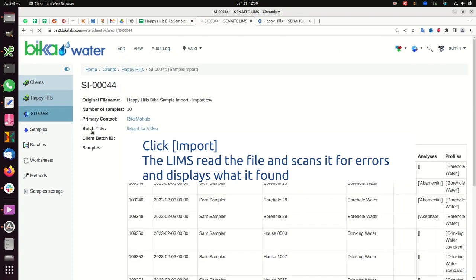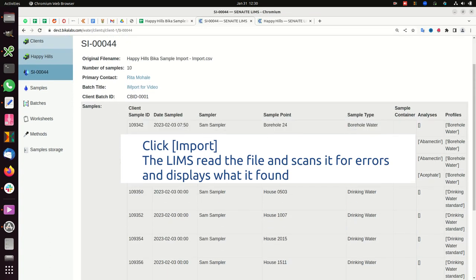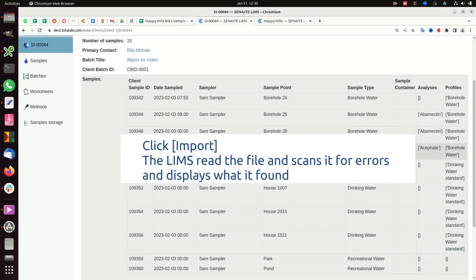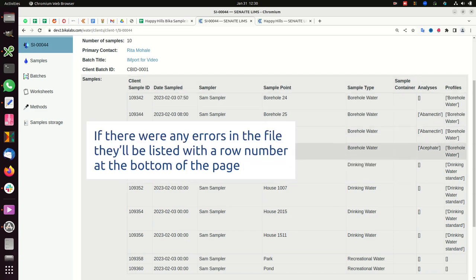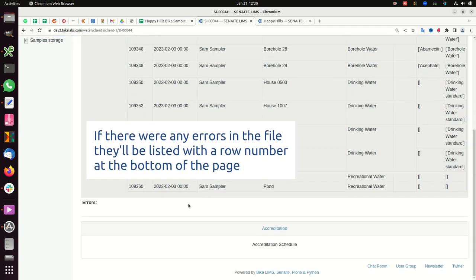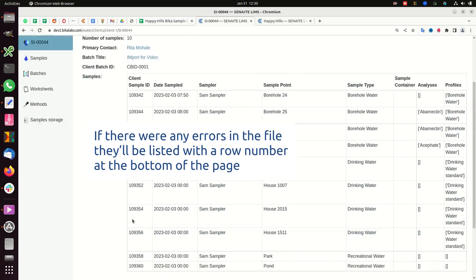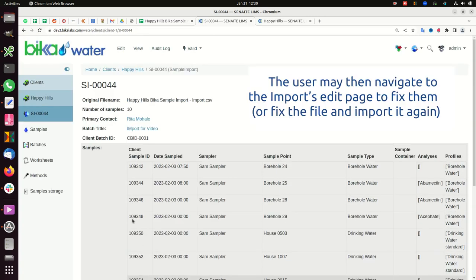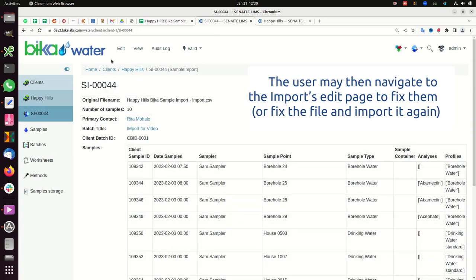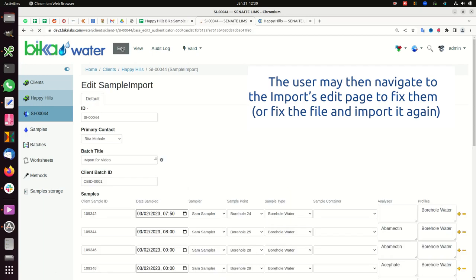Click import. The LIMS reads the file and scans it for errors and displays what it found. If there were any errors in the file, they'll be listed with a row number at the bottom of the page. The user may then navigate to the imports edit page to fix them or fix the file and import it again.